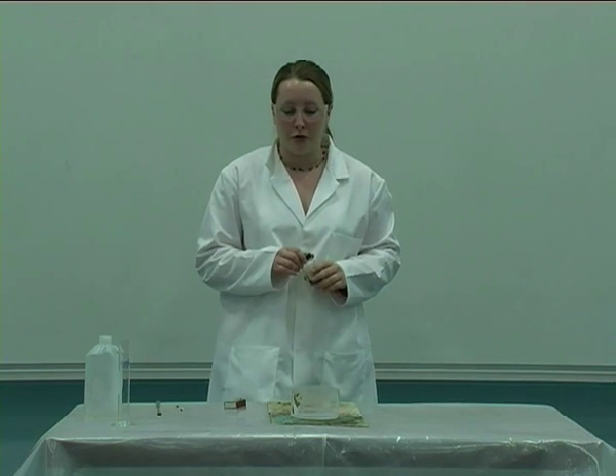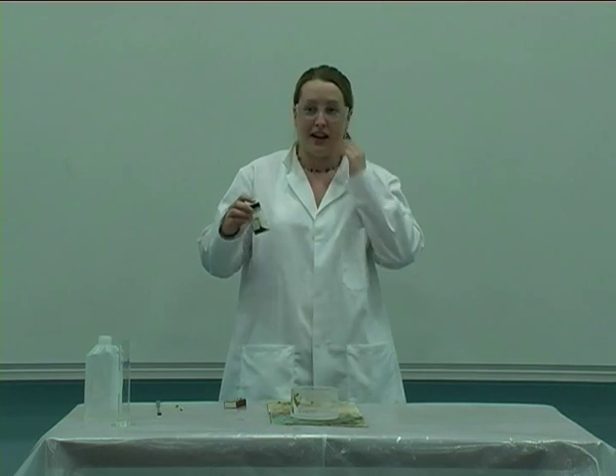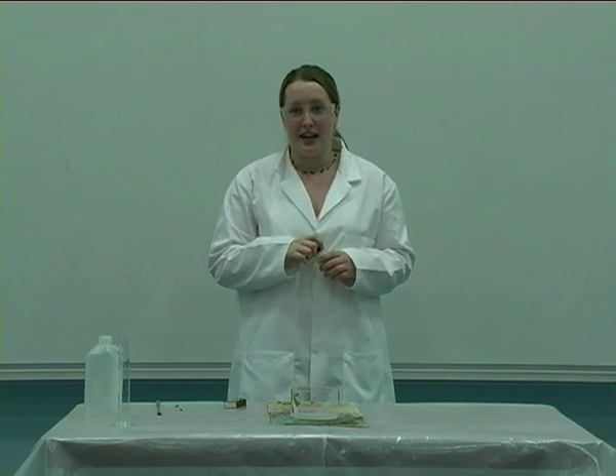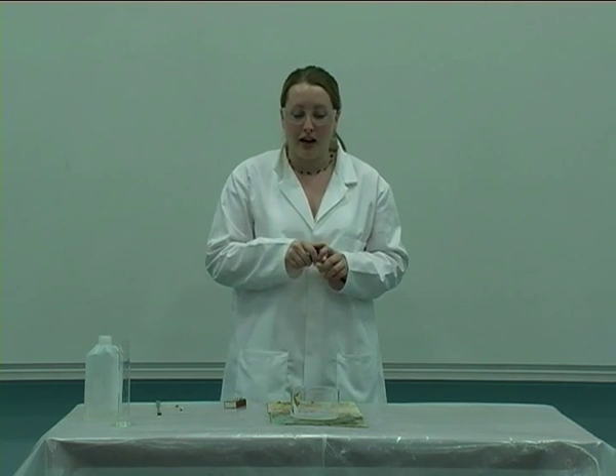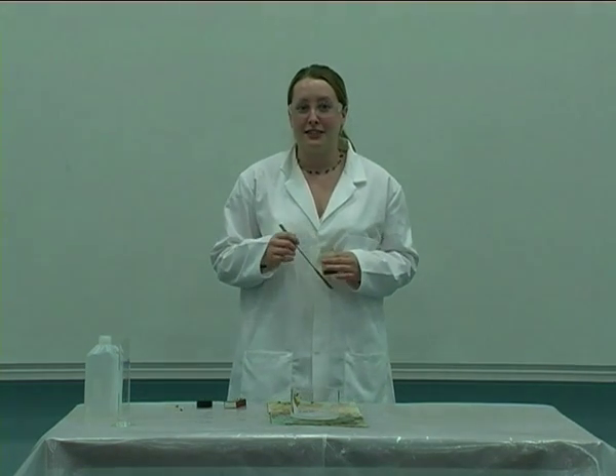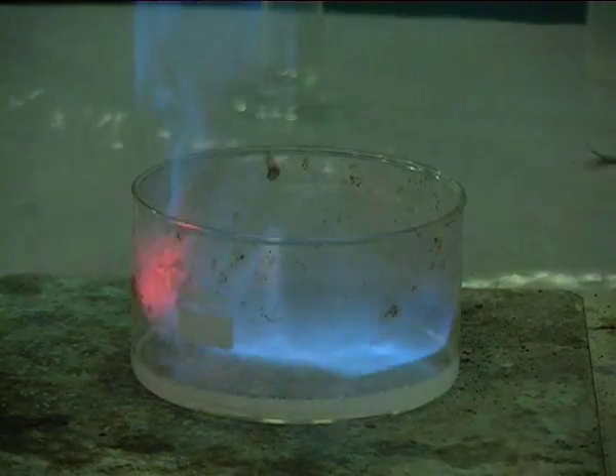Now at the moment we've got a very small flame. But what I'm going to do next is add some of this solid here, which is potassium permanganate, and it's going to react with the hydrogen peroxide to provide extra oxygen. And as it does that it's going to give us a bigger, brighter flame.